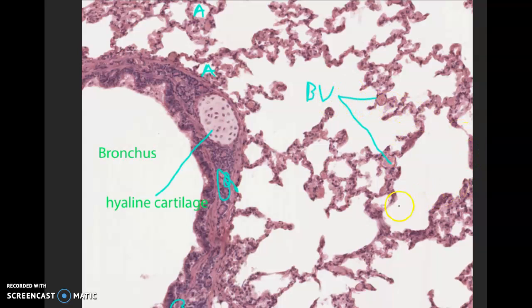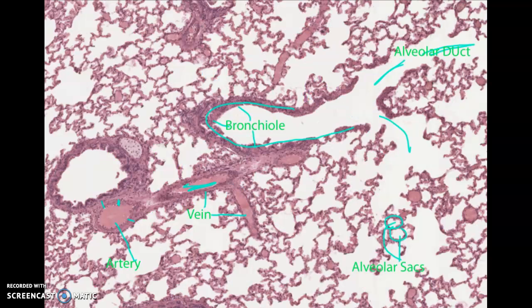And then this would be an alveolar duct right there. So basically the same things. The circles are the alveolar sacs, the long tubes like here and here. So this is what we were, actually I think this is what we were calling the alveolar duct on that picture. Maybe this was. And so forth.